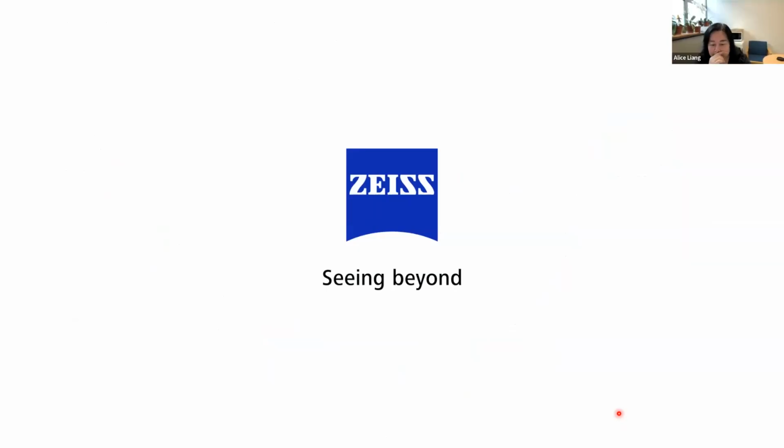Very good talk. Actually, I have a little bit of a challenge question. I don't know if you can answer or not, but looking at your presentation is very promising. As I know, X-ray microscopy is really useful when you try to search a sample in the dark black resin block, right? Once you look at the image inside the block, then you know where your region of interest is.